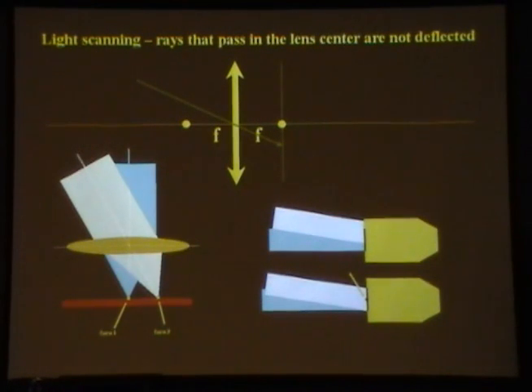not with a laser, with lamps. But the first commercial confocal microscope was sold something like in 1988 or 1989. And they actually chose the people that could buy these first ones. In the first confocal microscopes, they moved the sample around, and the images were just terrible. It only became a successful commercial product when they started to scan the laser and not the sample.